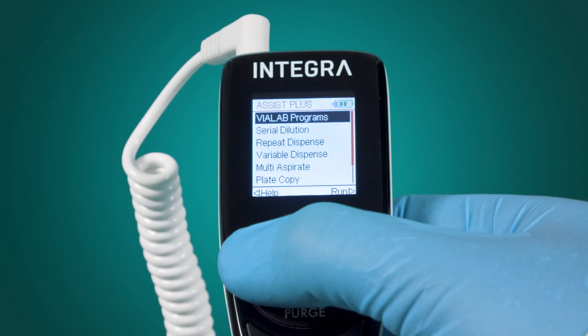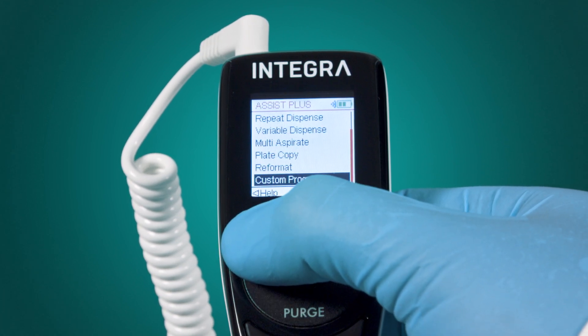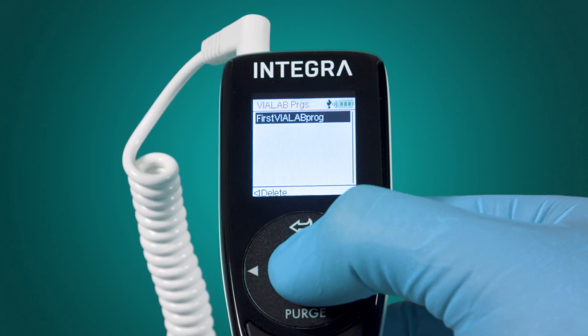Choose the category of the desired program — either a VIALAB program, one of the predefined modes, or a custom program — and select the desired program. Press the OK button and run.